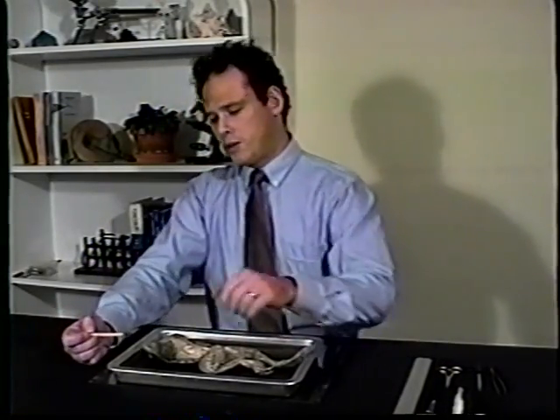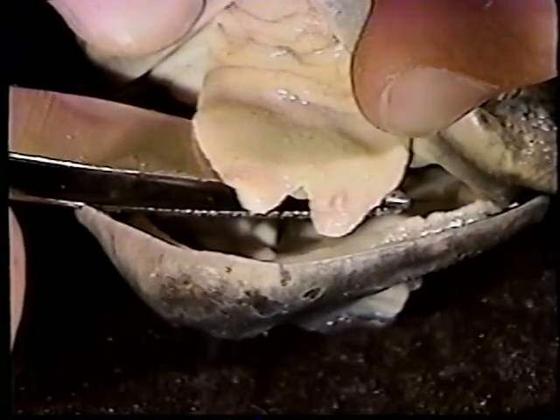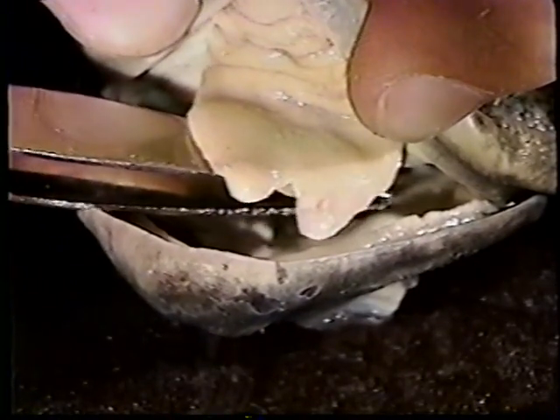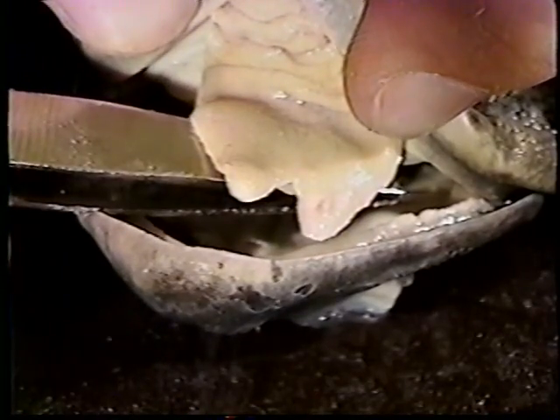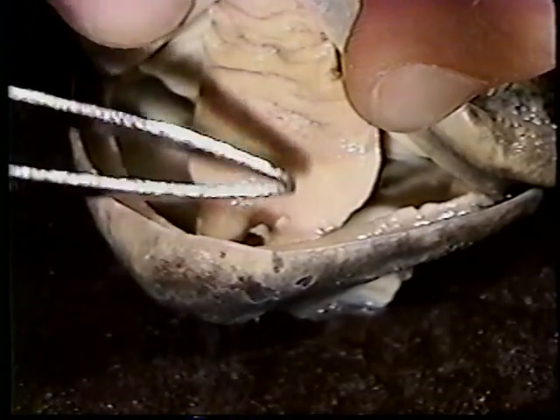As we open our frog's mouth, we notice that the tongue is attached to the front of the frog's mouth. On the other side of the tongue, we find a forked shape. This is the end of the tongue that leaves the frog's mouth and has a sticky substance on it that traps prey. Almost as quickly as the frog's tongue has left the mouth, it recoils back into the mouth with the prey securely in hand.